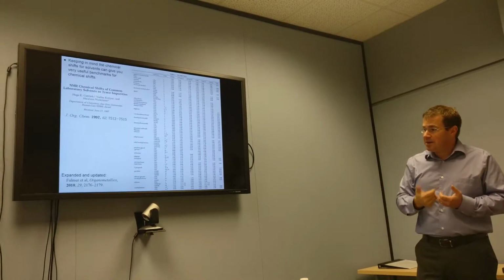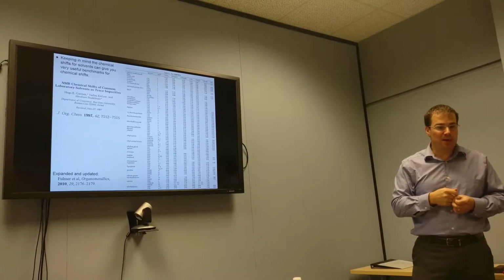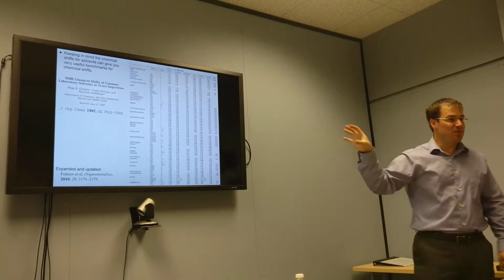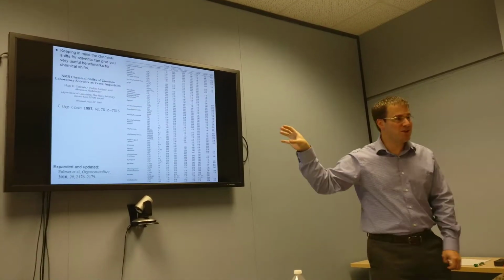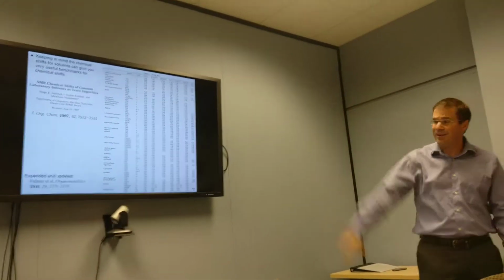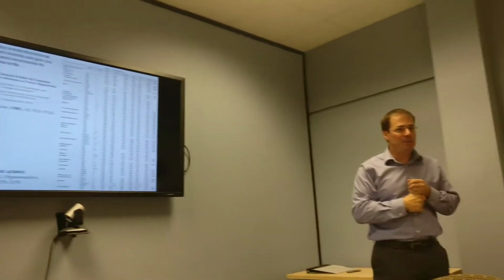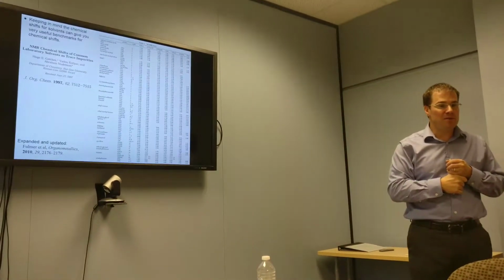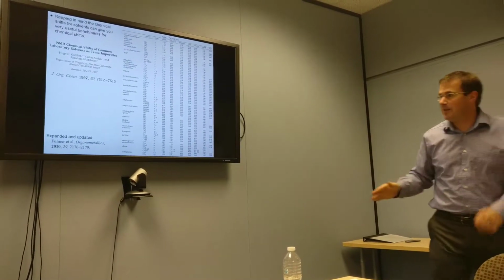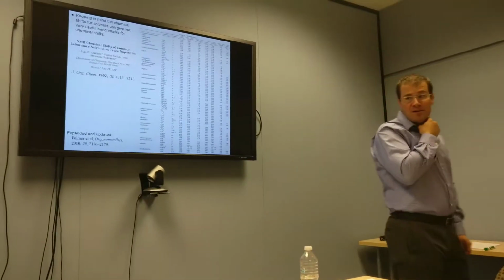That's since been expanded and updated, and mostly what happened in the subsequent paper is that the organometallic community realized, hey, this is a really useful reference, but they haven't included a lot of the solvents that organometallic chemists sometimes use. And so they went back and they reran all of these and added another maybe 10 impurities. But the biggest thing was that they measured them in more different solvents, and they published that in this Organometallics paper.